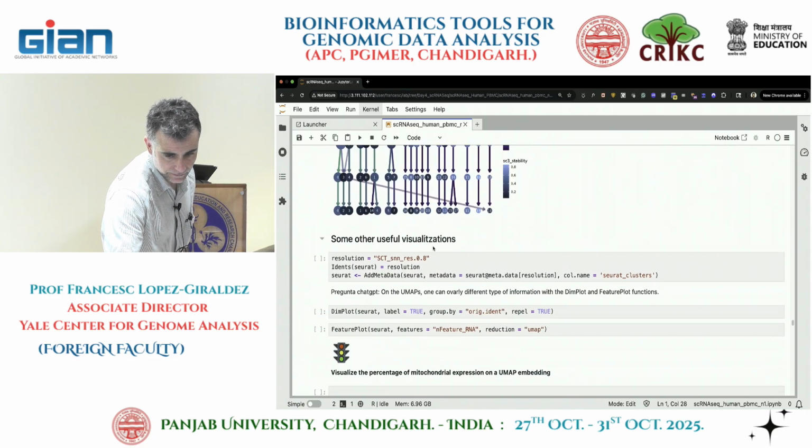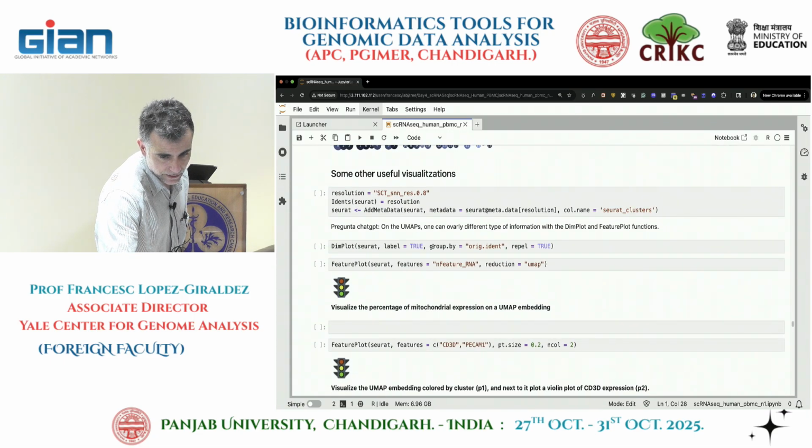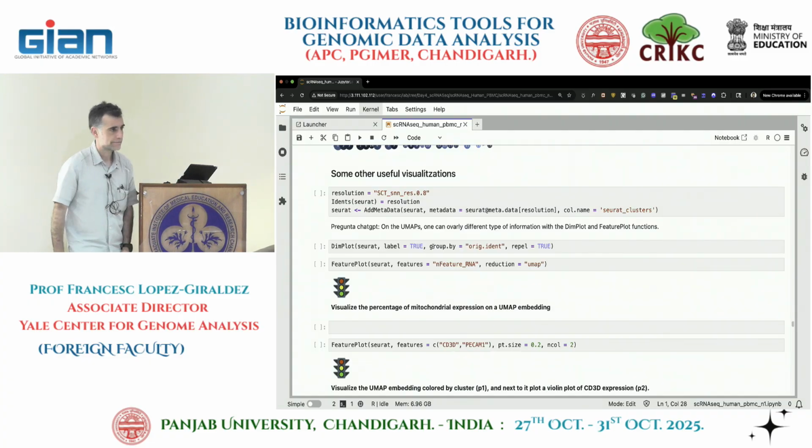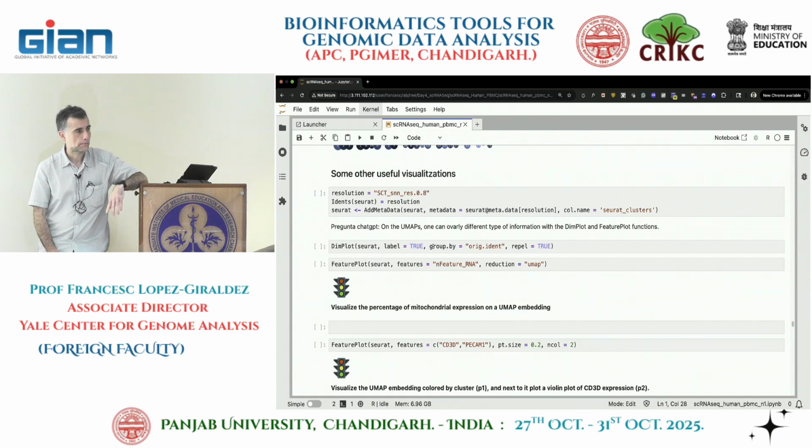What is defining resolution here? So if the cluster is dividing or getting into 2, upon increasing the resolution, right? Yes. So does it mean that the genes which we took into account in one cluster were part of 2 cell types?